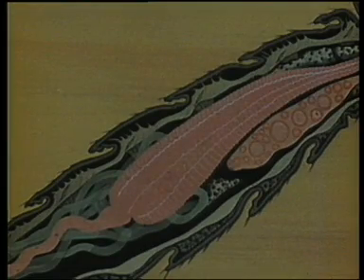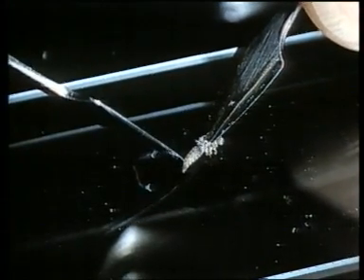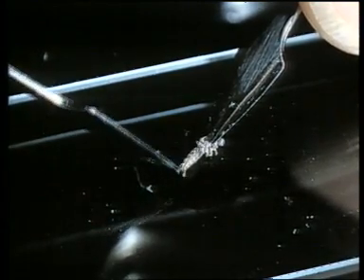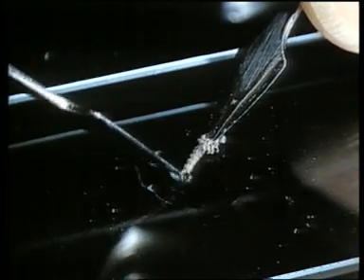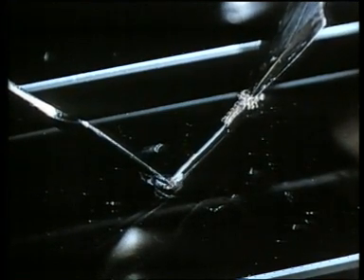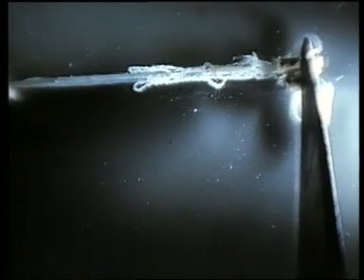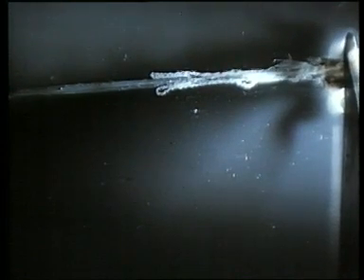The second stage in the dissection is to remove the stomach of the mosquito. The insect's body is transferred to another slide into a new drop of saline. The thorax is held with one needle, and the other used to nick the abdominal covering just above the tail, at the level of the sixth or seventh abdominal segment. These detached segments can then be gently teased away, and the gut pulled away with them. It needs a little care and patience. First the malpighian tubules and hindgut, then the stomach or midgut, and finally the esophagus.